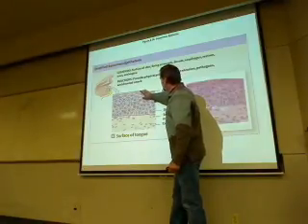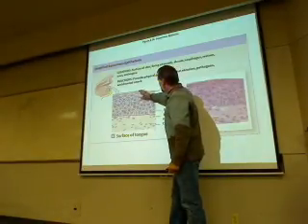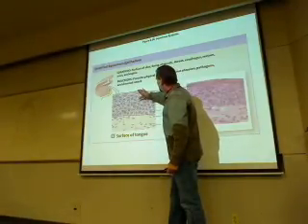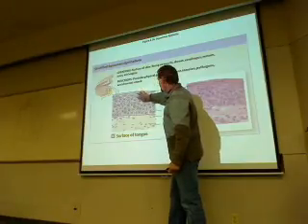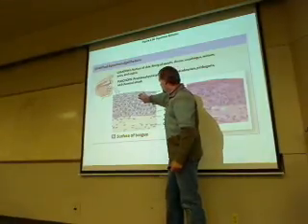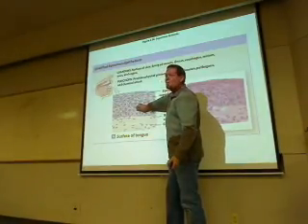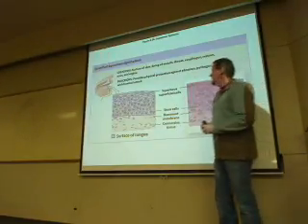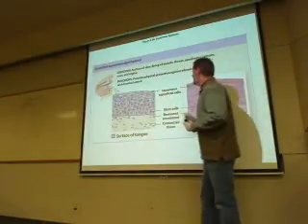Even though this layer up here doesn't appear super thick, maybe compared to the spinosum down here, that's because they're flat. There are about 25 to 30 or more layers of flat cells up here, and down here there are probably around 12 to 20 of the other cells.